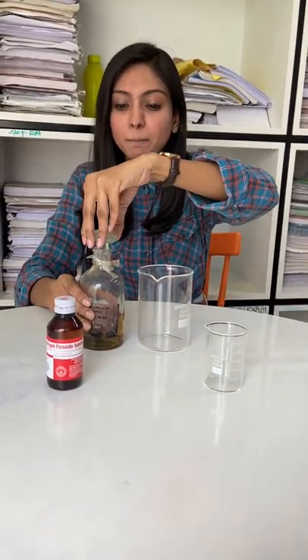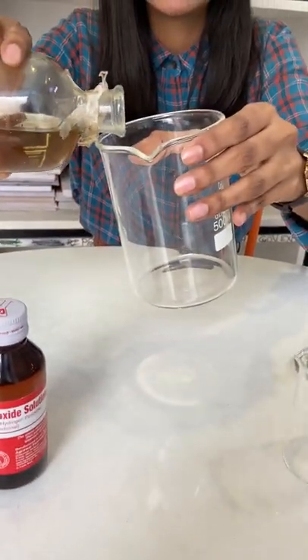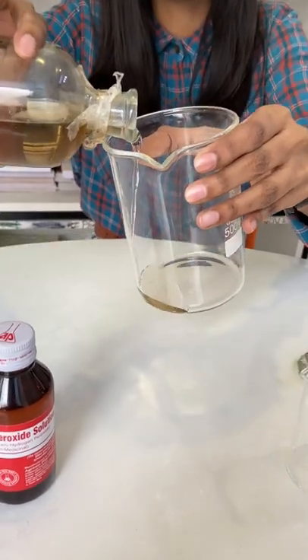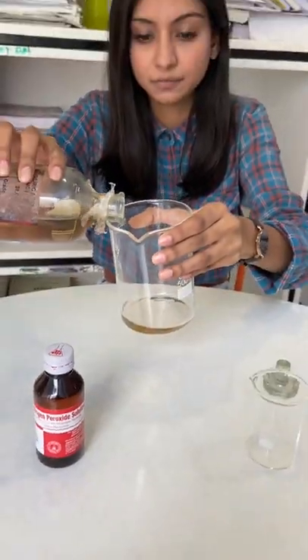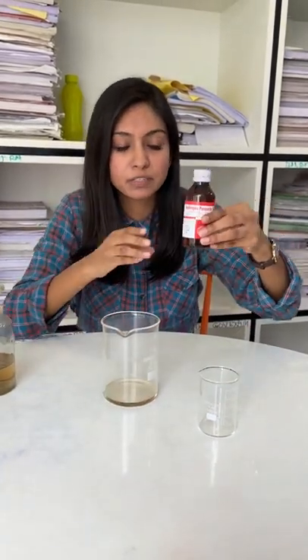I am taking Sulphuric Acid — we will use it very carefully. I will add Hydrogen Peroxide. We will take this in a 3 to 1 ratio.